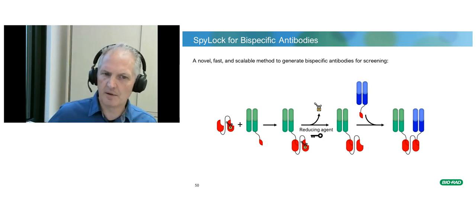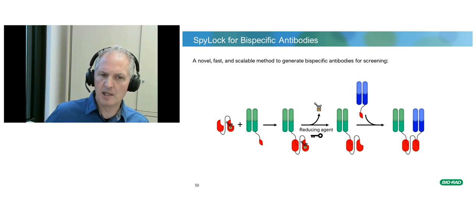Basically, we have 2 methods, a quick method and a purification method. In the quick method, we get the product in about 90 minutes.